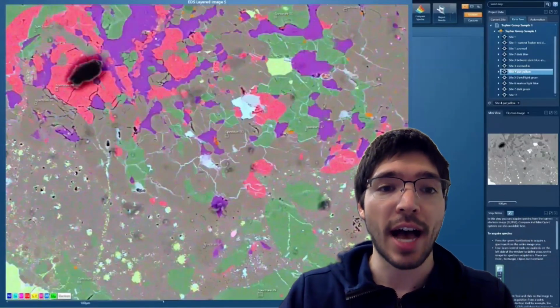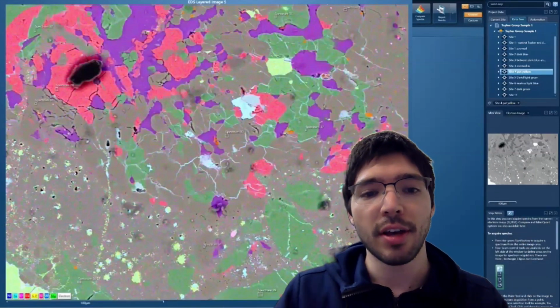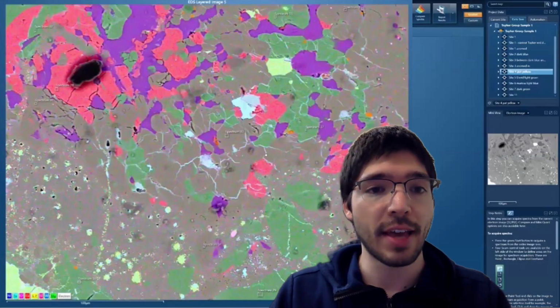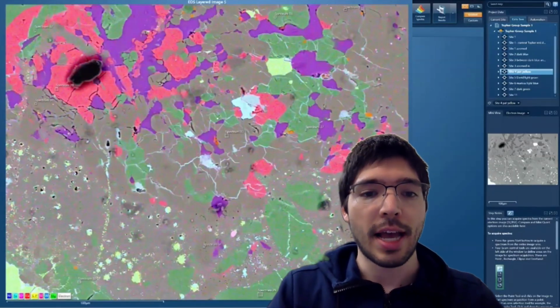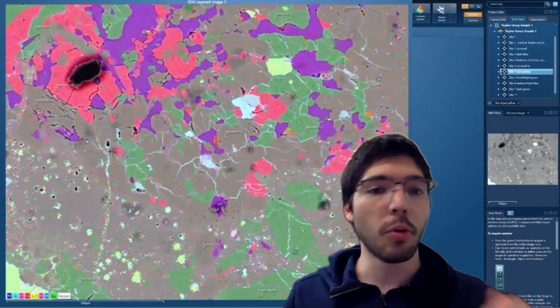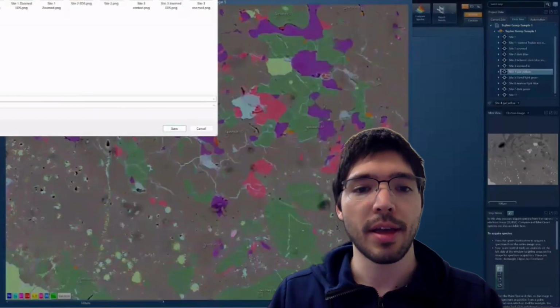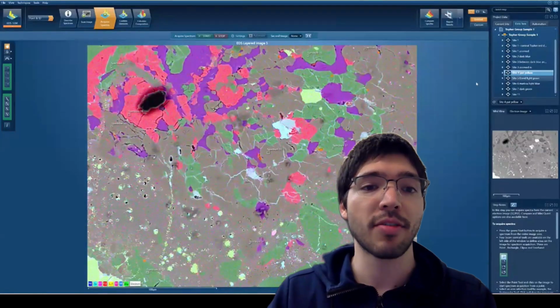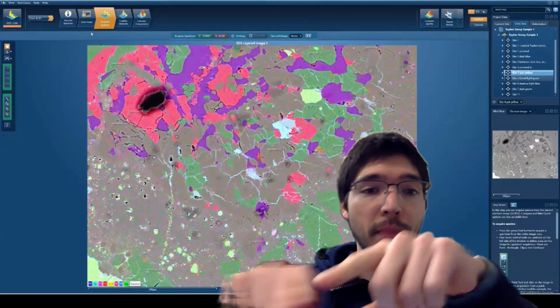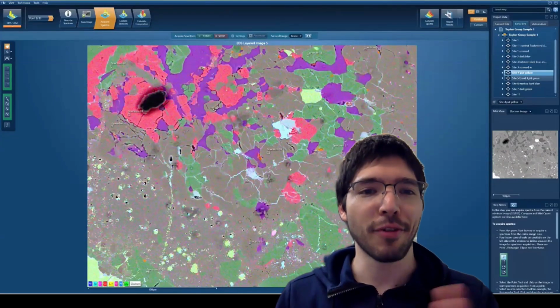Troilite, which is going to have iron and sulfur, is also going to be pretty bright. And materials that have low Z elements like sodium, potassium, even in some cases silicon, magnesium, are going to be darker. So you can use this as a tool to identify different minerals just based on their average atomic number. It's not perfect because different minerals, of course, can be zoned, meaning the concentration of elements in one point might be different than everywhere else, in which case I'm using these chemical maps to differentiate them.